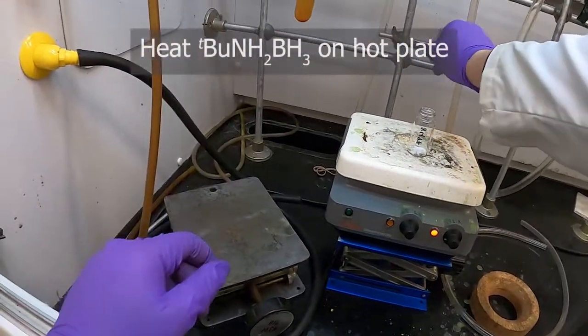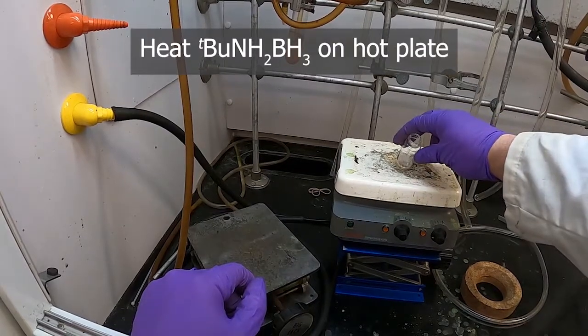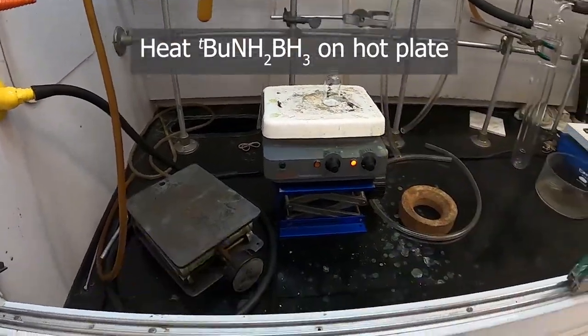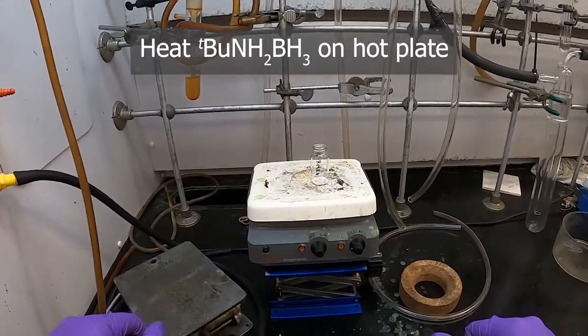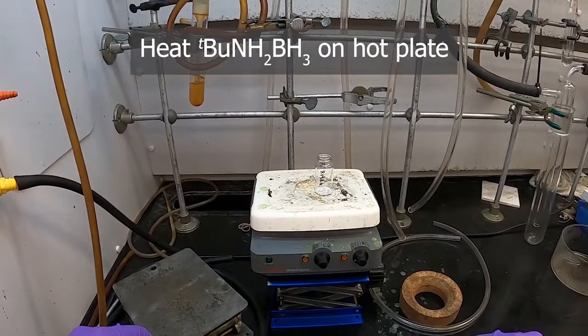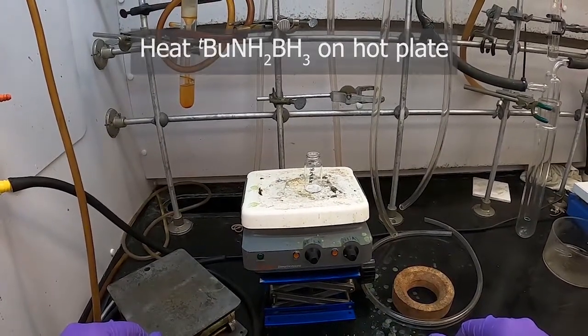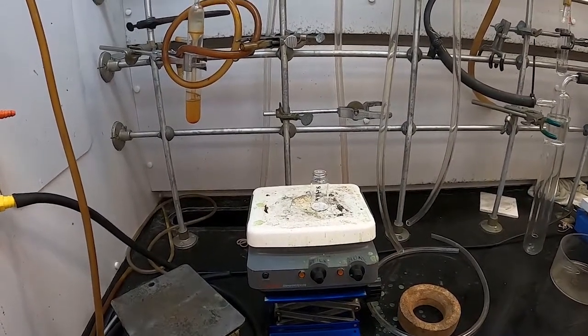So I've got this hot plate here heating up a little bit already, and I'm just going to set this vial here on the hot plate. Get it kind of spread out on the bottom to form a nice, even layer across the bottom of the vial so it heats nice and evenly. And we'll heat this, crank it up a little bit now and then until we start getting some gas evolution, and then I'll bring you back in and show you that part.